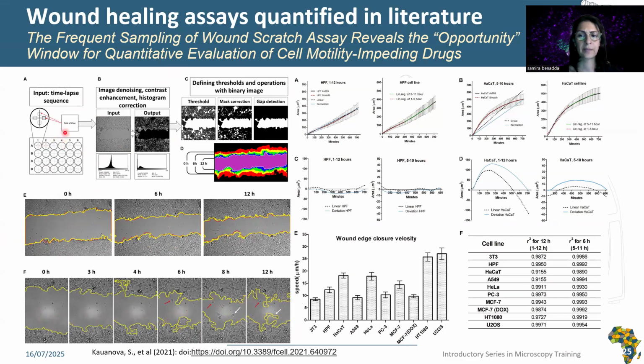the velocity. So the processing consists of noise filtration to enhance the cell contours or contrast, and then thresholding and binary mask rendering. So first, the software processes each input grayscale image and applies an image correction procedure where noise filtering and histogram reassignment are performed.